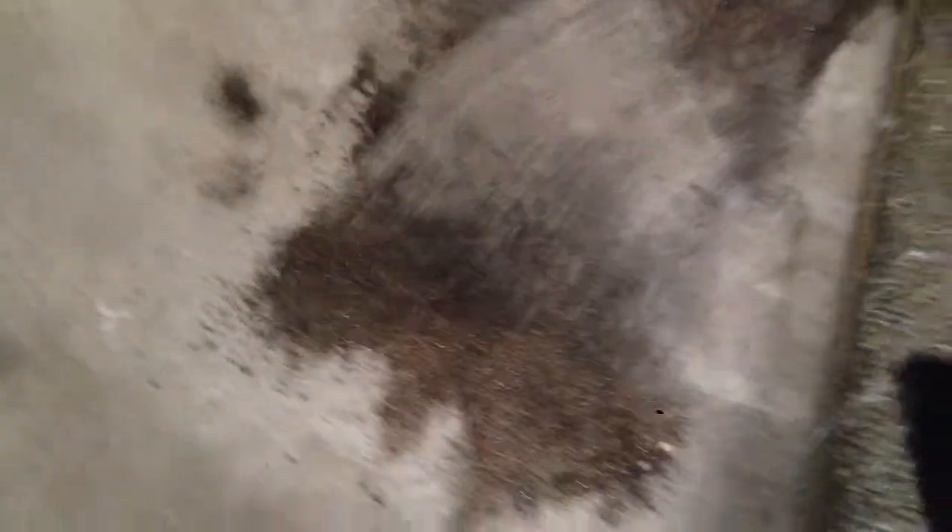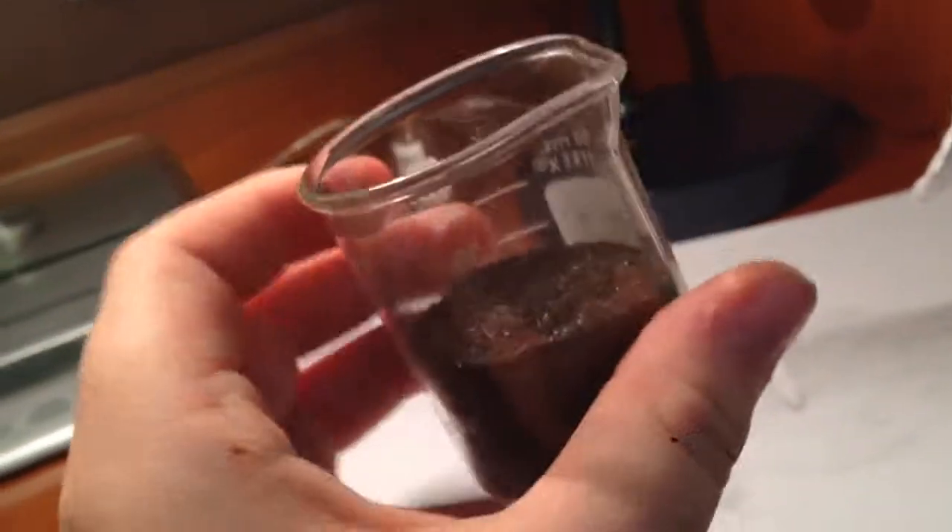And of course, you always have to clean up your work area. I started out with 41 grams, and — correct me if I'm wrong — but we ended with 27 grams.